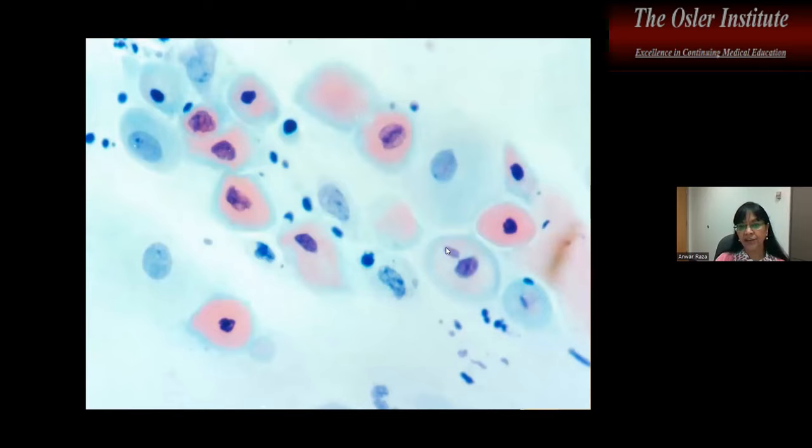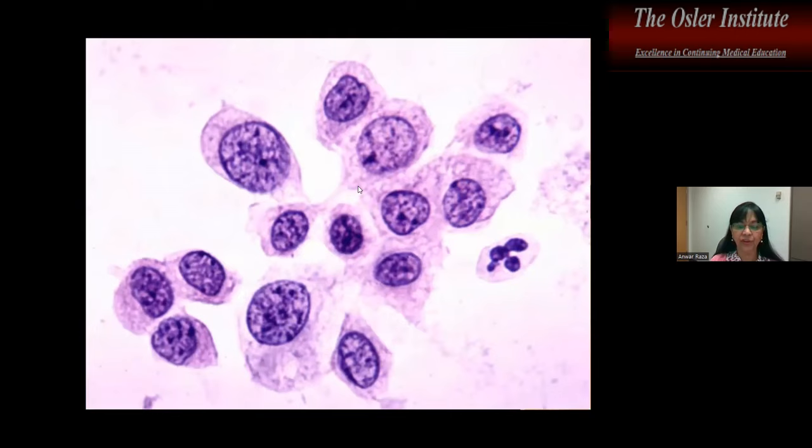Another kind of degenerative change would be pyknosis, where it just gets dark and just condenses. So you've got pyknotic nuclei here. However, this cell size is kind of small, and that's too much nucleus. So even though there's pyknosis here, that appears to be dysplastic, right? Very high NC ratio going on there.